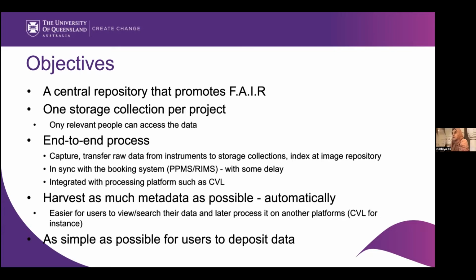So what we proposed and implemented is a project-centric approach, which means only one storage collection is offered per project, and only those relevant people who are the members of that project can access their data. So in these terms, the data security is now manageable. The next thing was, we wanted to provide an end-to-end process.